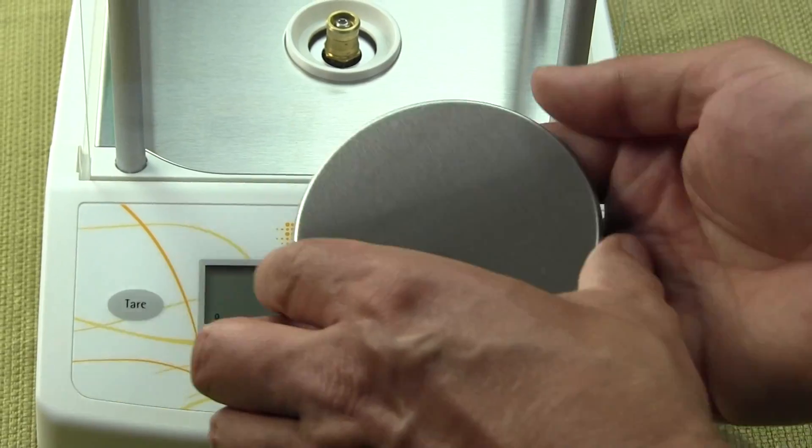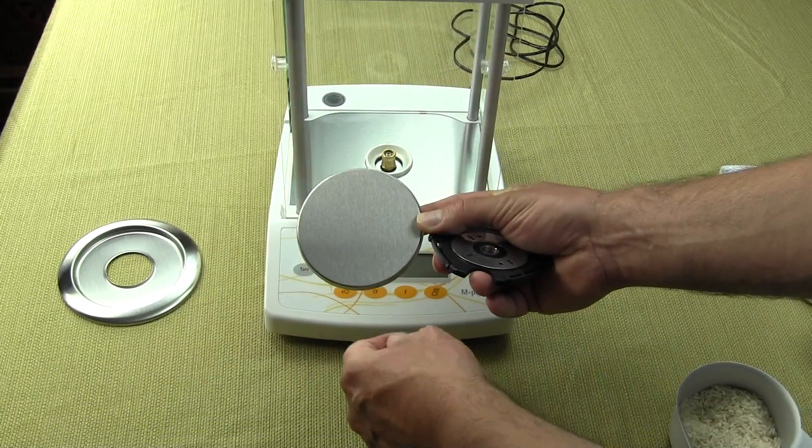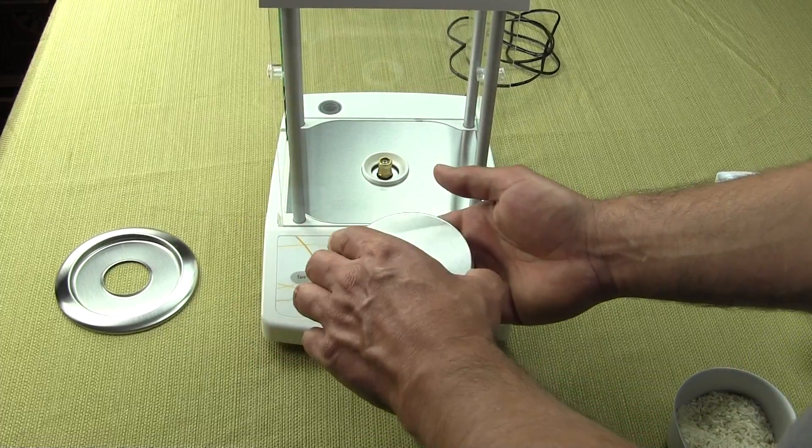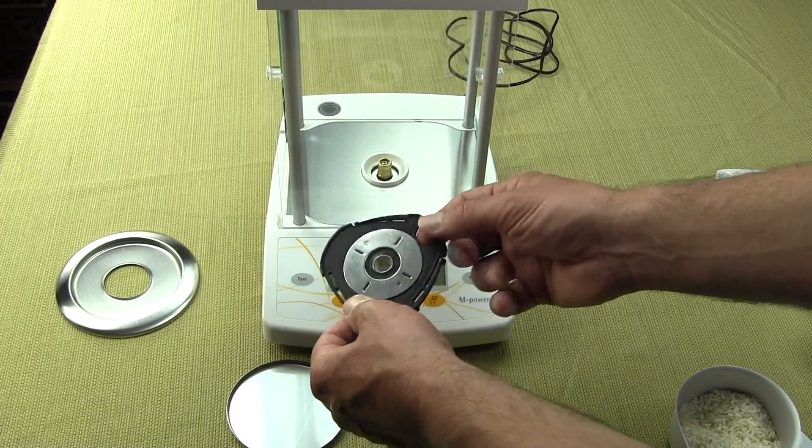On Sartorius' other balances, the weigh pan would be much larger. This is a round three and a half inch diameter platform. You can see you have the weigh platform and this is the pan support.